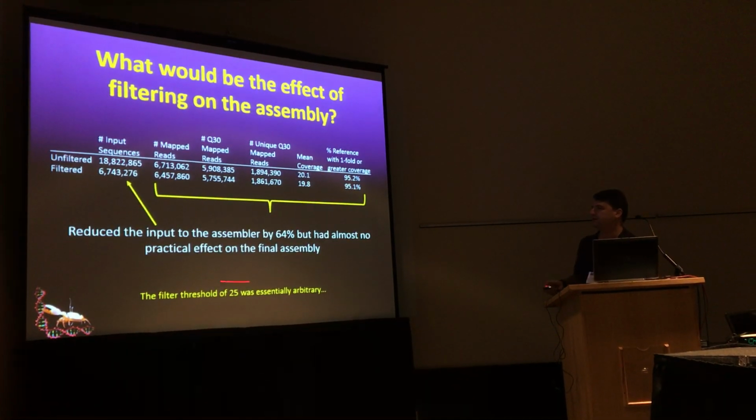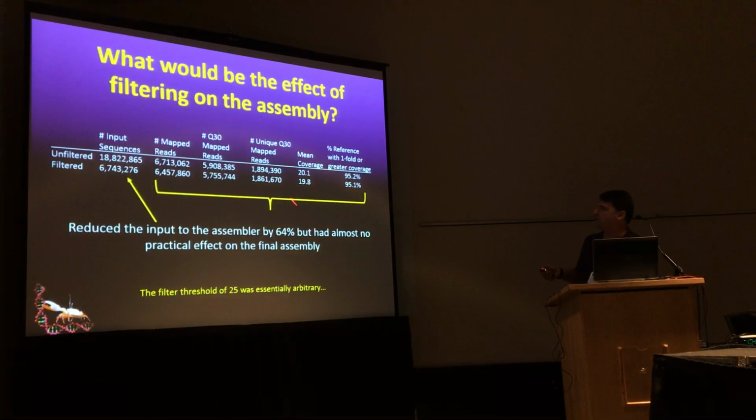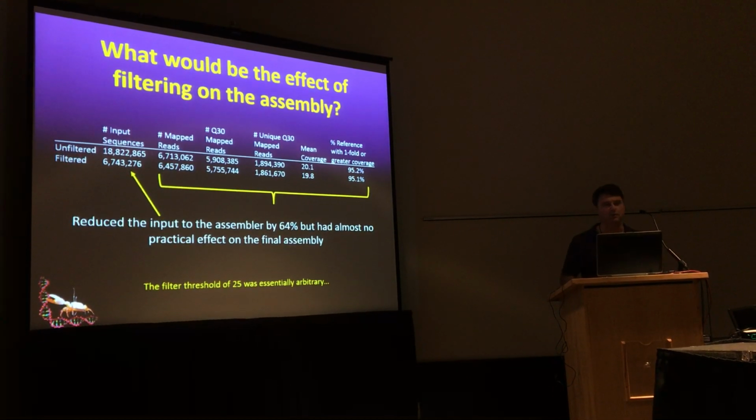It took a huge load off the assembler. The assembler worked a lot faster once you've done this filtering, but we didn't affect in a major way our assembly, which was really nice and what we wanted.